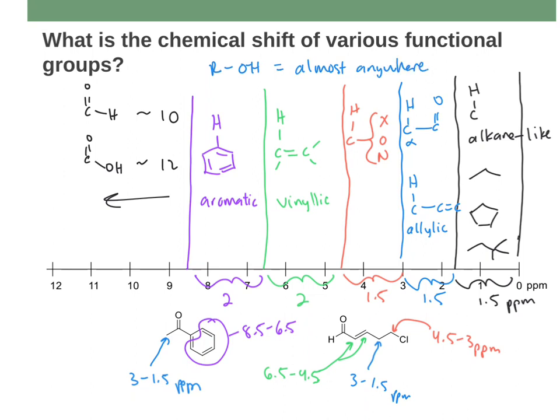So you're just going to look for some singlet OH peak somewhere, almost anywhere. They can be around 1, they can be up near 9, 10 if they're on a phenol or something like that, if they're on an aromatic ring. They can show up almost anywhere, so there's not really a good region to say that they're from. But OHs are common enough that I need to say this.